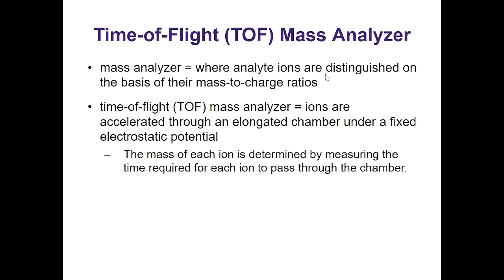And everything that you're not selecting for at that given moment is wasted, right? It's going to go off to the vacuum, gone, done for, okay? A time of flight, on the other hand, you get stuff that hits first, middle, last. You don't really waste it, right?